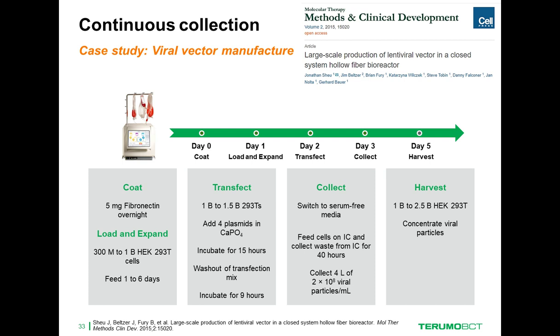Post-transfection, the media was switched to serum-free media automatically, and viral vectors were collected continuously in the waste bag over the next 40 hours. And finally, the HEK293T cells were automatically harvested for QC.